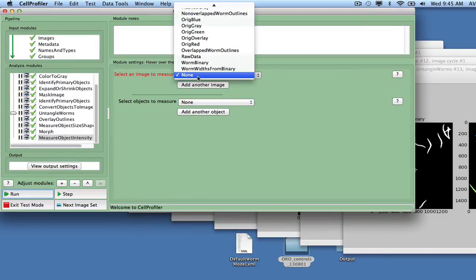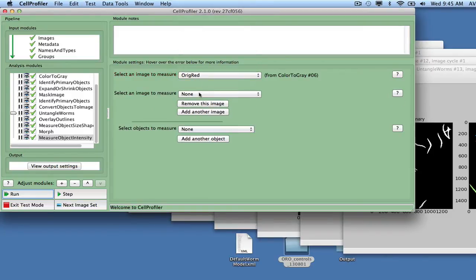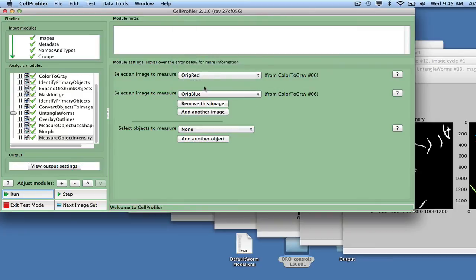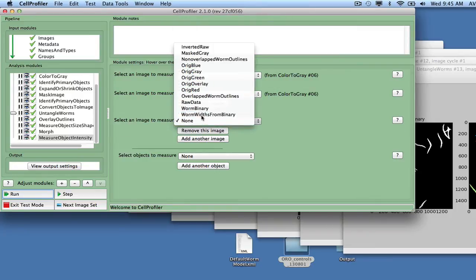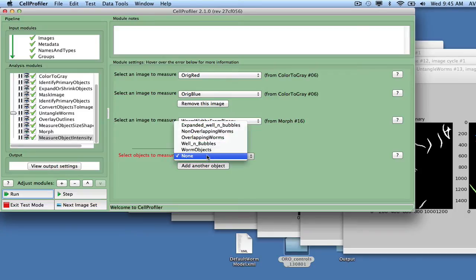Select Non-Overlapping Worms as the objects to measure. The Measurements on Worm Widths from Binary will provide information on the worm widths, while Measurements on Ridge Red and Ridge Blue will provide information on the stain distribution and color.